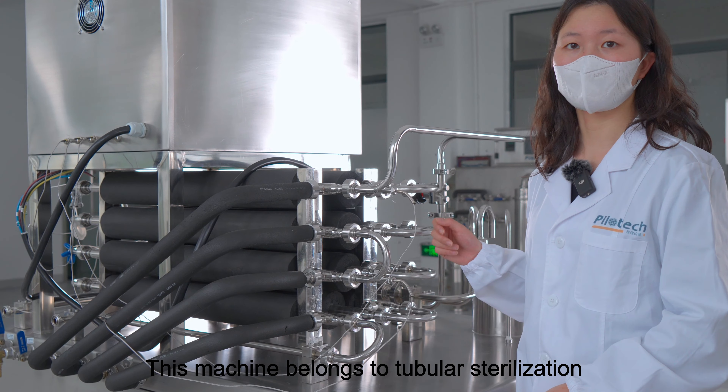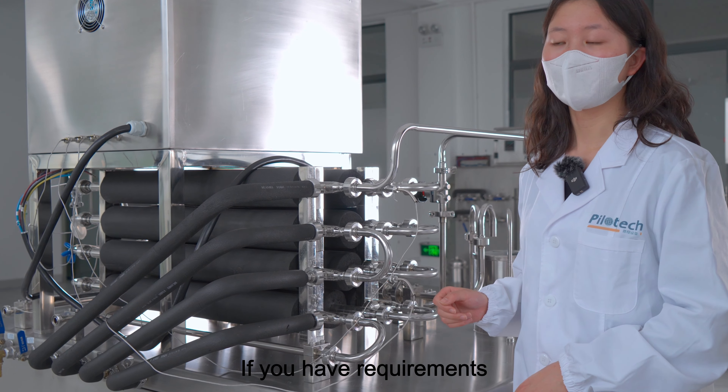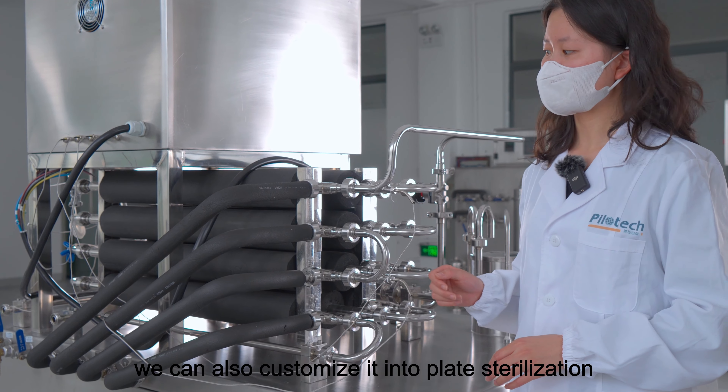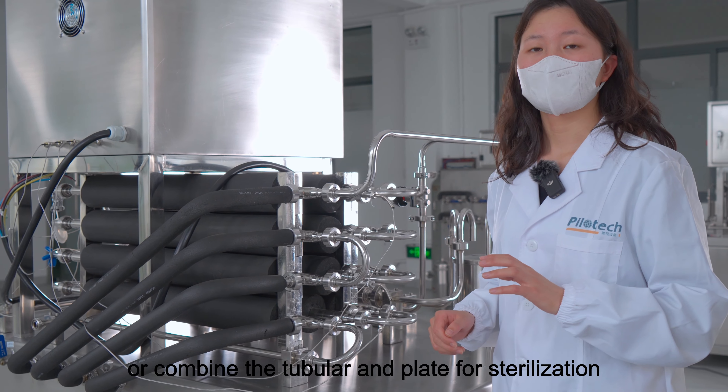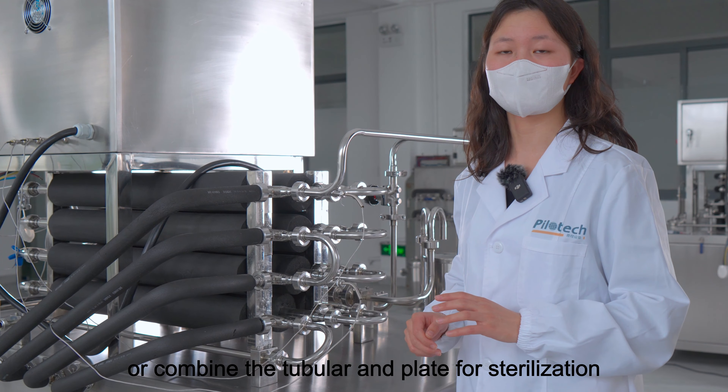This machine uses tubular sterilization. If you have requirements, we can also customize it into plate sterilization, or combine the tubular and the plate for sterilization.